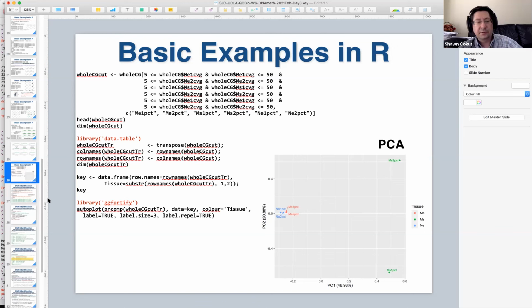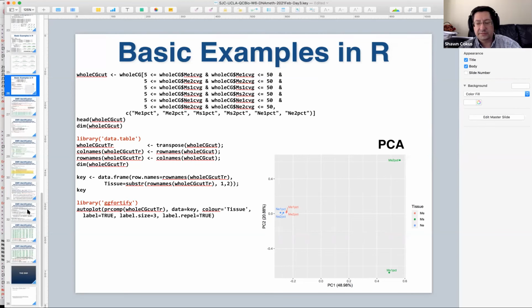All right, so we've got 45 minutes left, and that'll be enough to finish off the demo. We could go on forever, but we're just going to cut it at some point. The goal is really to give you a solid basis on the primary analysis, the mechanics of it, what each of the files means inside, and how to manage them. Without that base, it's hard to do the downstream in a good way. The downstream is more specific to what kind of project you're doing, and it's easier, I think, to pick up. You can't do it unless you have the base analysis in good shape.